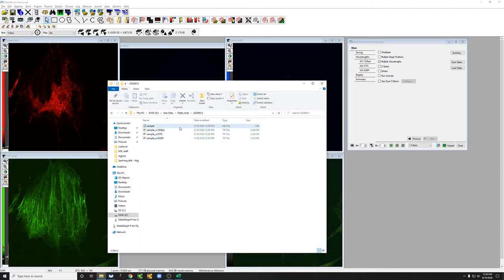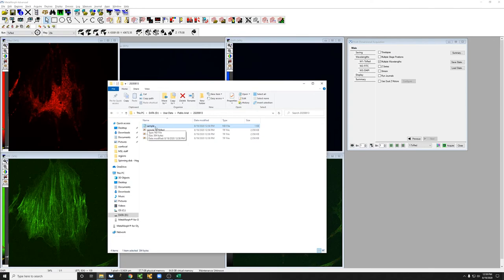And then there's an additional nd file, which has the base name. This is very convenient because you can take this file, drag it into Fiji, and it will automatically understand the metadata, that it's three channels, and the proper scaling.